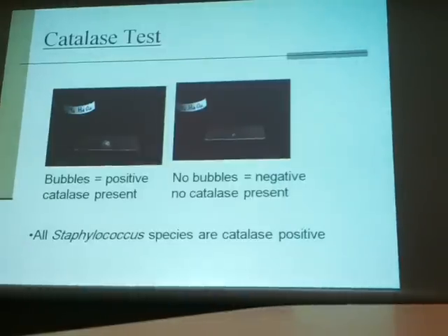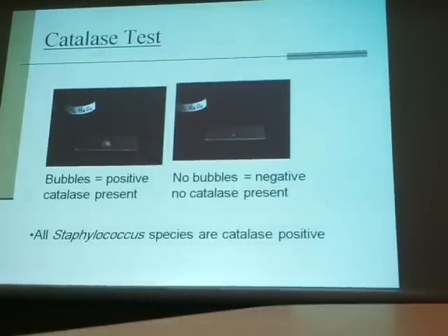Okay, this one is catalase positive, and this one is catalase negative. Catalase negative means Streptococcus. We have beta hemolysis, so it's a beta hemolytic Streptococcus species.